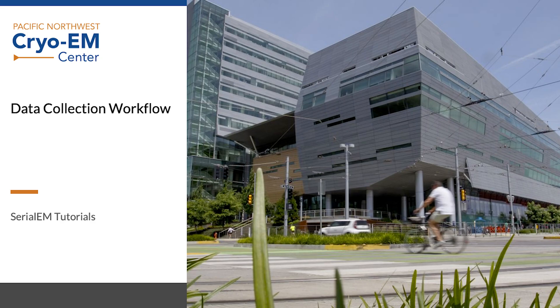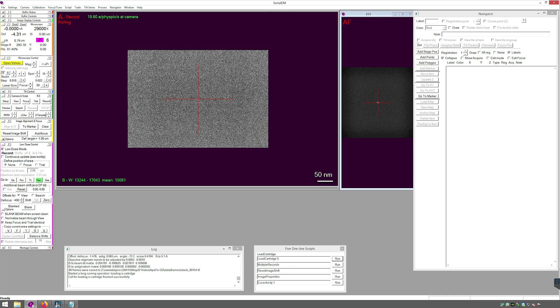In this video, I'm going to set up Serial EM for data collection. Open a navigator window if you do not have one open already. Open the column valves and press search.